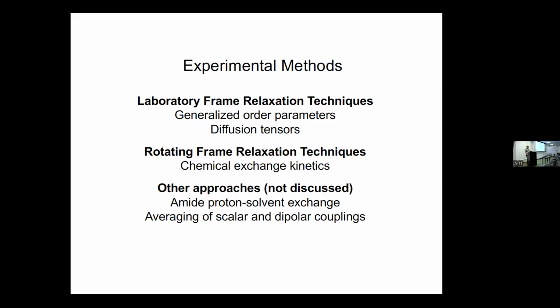It's incredibly sensitive, but at least in proteins, the situation can be different in nucleic acids because of the pH dependence of exchange. In proteins, you're kind of limited to getting an equilibrium constant, never any rates. Of course, equilibrium constants are nice things to have. So probably a little underutilized today.